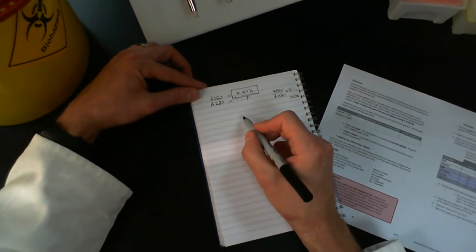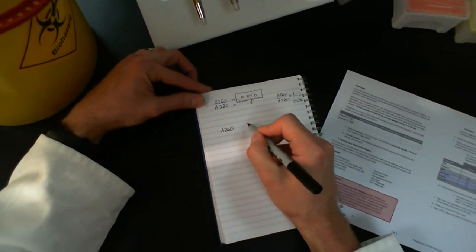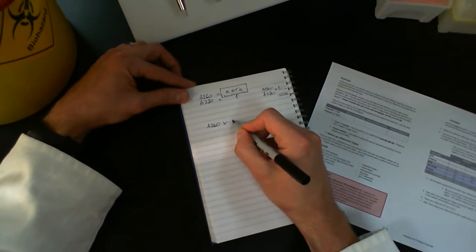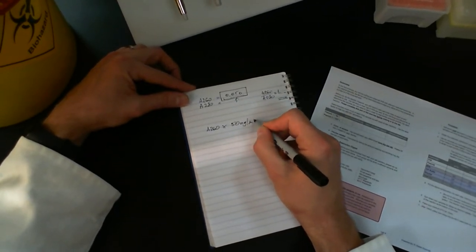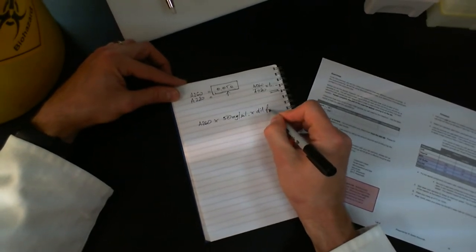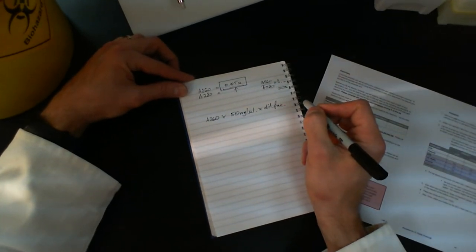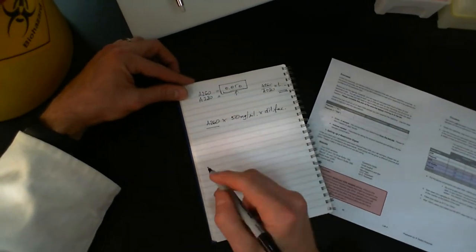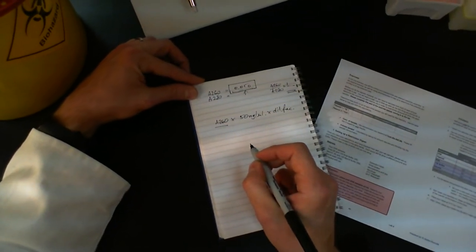The formula you're going to use is A260, whatever you got at A260, times 50 nanograms per microliter, times the dilution factor. That's going to convert this number into the concentration of DNA in your sample.